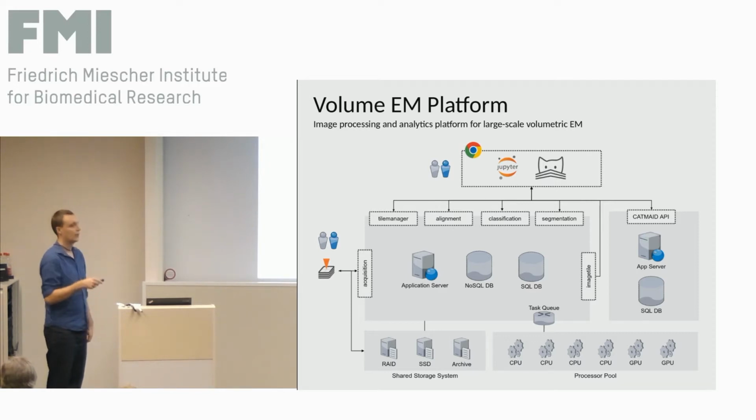So you can open your web browser and you can see the images coming in. They are placed roughly where the microscope thinks they are. And you can inspect the data through the web browser as the data comes in. At the same time, the server manages the tile metadata. This gets stored in a database inside here, and attached to it is the shared storage system.